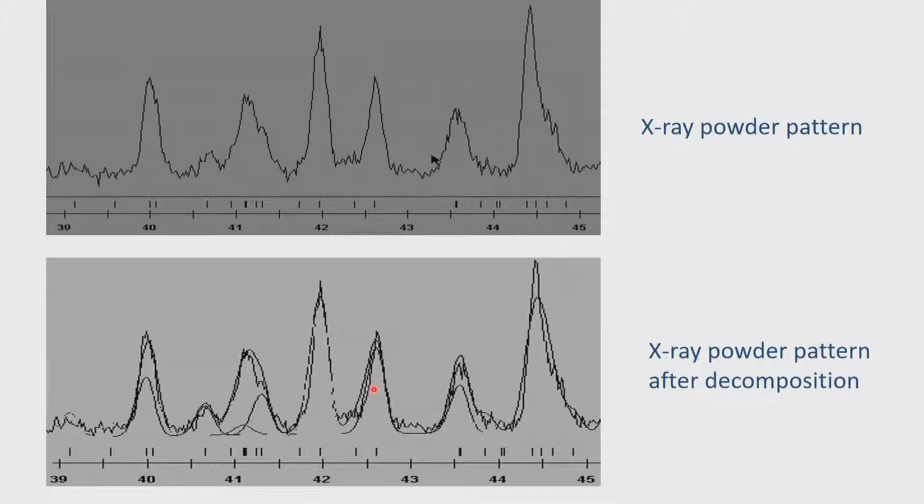The shape of the profile can be fitted under this particular curve. This is a curve going from 39 to 45, and under that, each and every position of HKL is associated with a peak. The shape of the peak, how we assign it, I will tell you in a minute; that is referred to as the profile refinement protocol. So we distribute the peak positions.